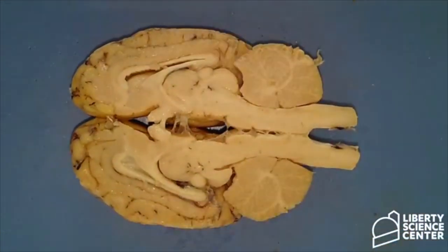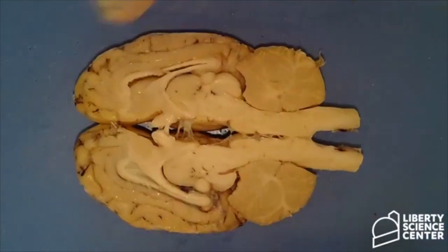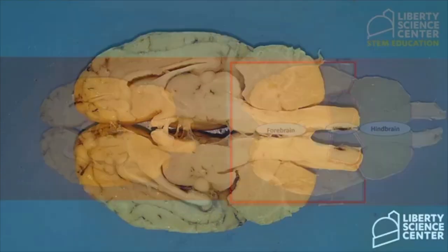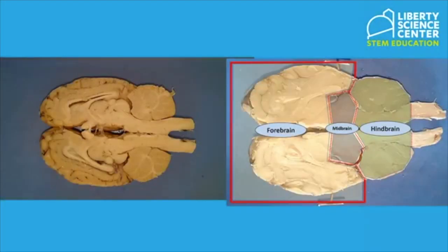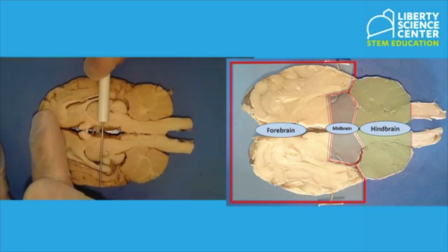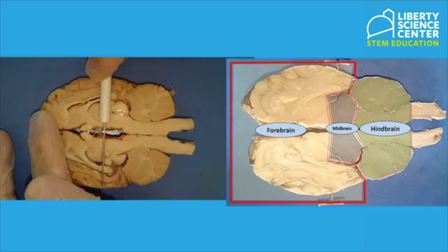All right, so you notice that there's a lot of different structures. We actually have different regions. Let me bring that up real quick for you. What you see here, this portion right up here, all the way here, is called the forebrain. That's the region that has the cerebrum, which, as you can see, is a very large portion of the brain.